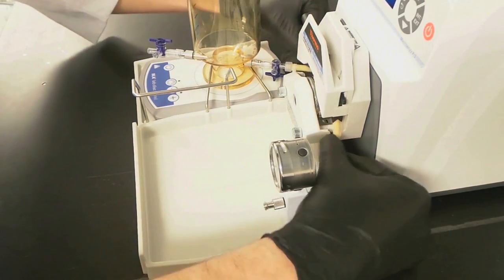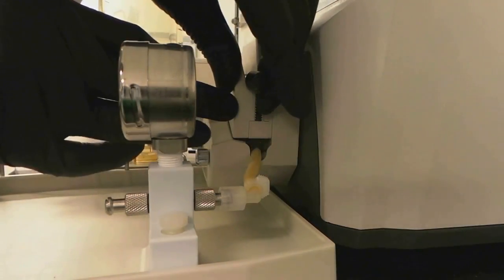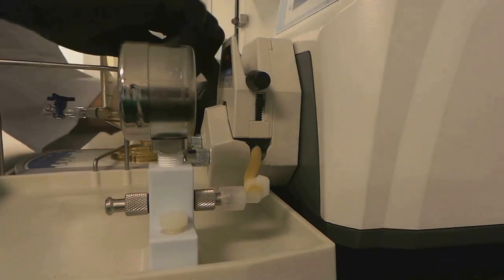Make sure the tubing is aligned correctly before engaging the pump head, and go to each side of the pump head and press down on the teeth to help keep the tubing in place.